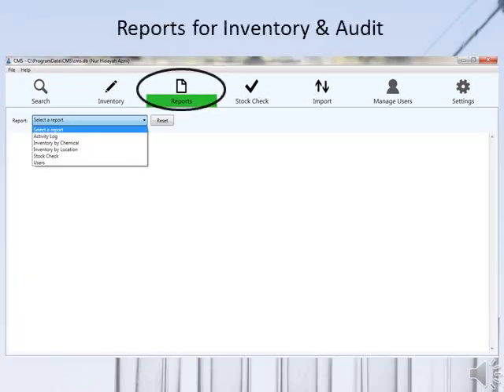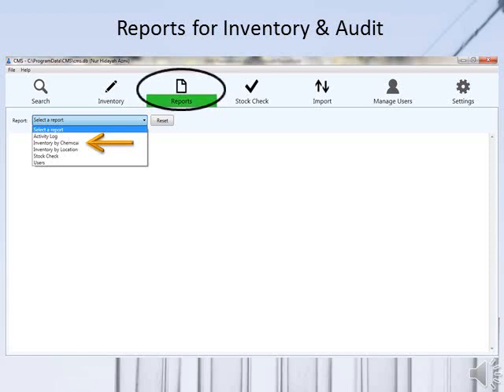Inventory reporting and audits are common practices used to report chemical quantities. Reporting requirements involve a search for specific chemicals and a report of total quantities. The CMIS software assists in reporting requirements by providing the option to produce simplified, exportable reports. There are five optional reports that can be generated: activity log, inventory by chemical, inventory by location, stock check, and user.